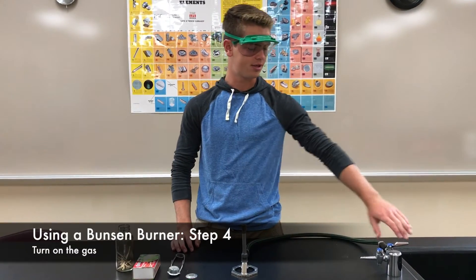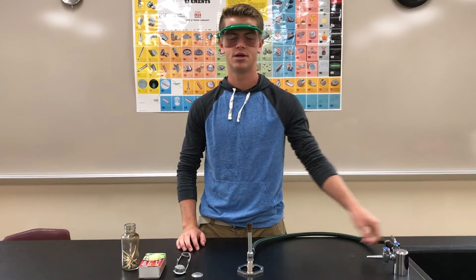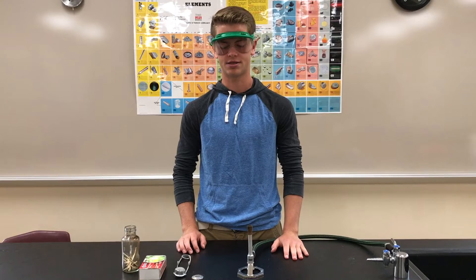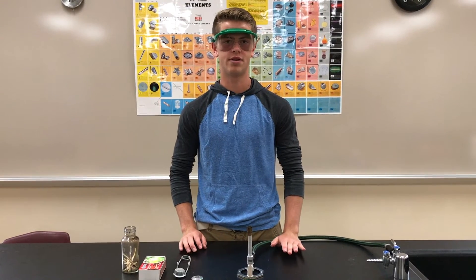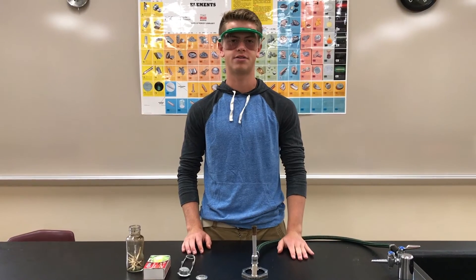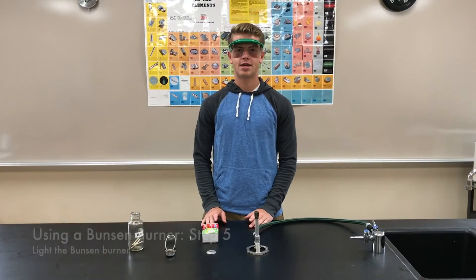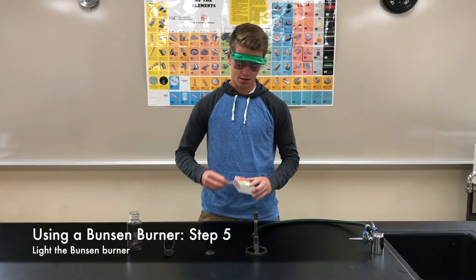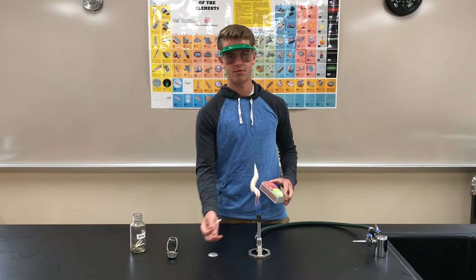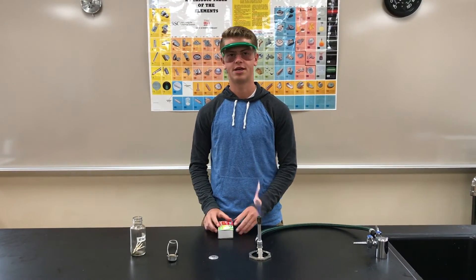You need to turn on the gas by twisting the valve until it is parallel with the hose. You will be able to hear a faint hissing because of the escaping methane gas. You do not want to leave the gas on for too long without lighting it, because lots of methane will escape into the room and that is a hazard. Once the gas is flowing, strike a match and light it. Hold the match away from the flame, and when you are done put it in the used match container.